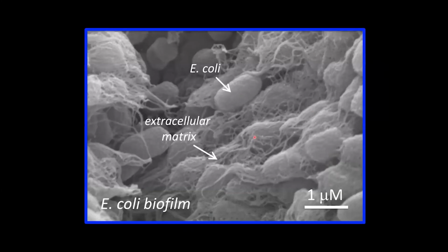And this is our E. coli again, where when you look at the micrograph, you cannot tell which part is curli, which part is cellulose, how much of each component is there. And this is where we sought to use solid-state NMR.